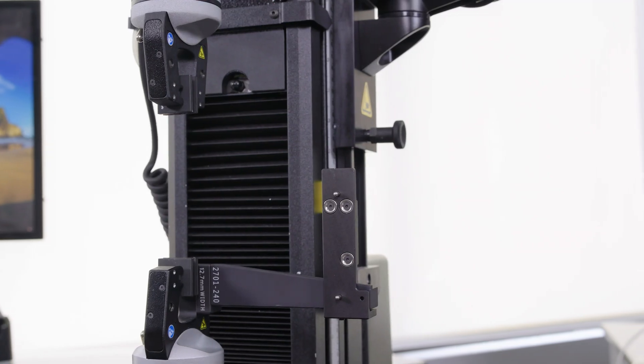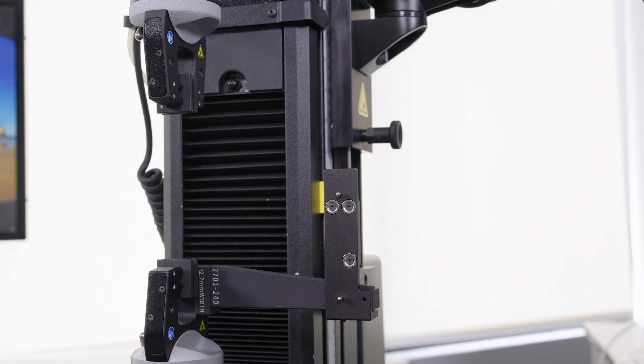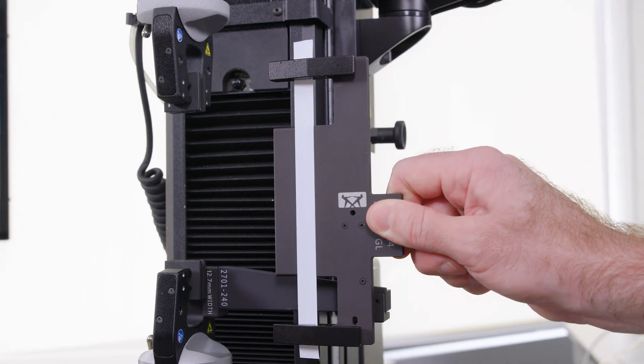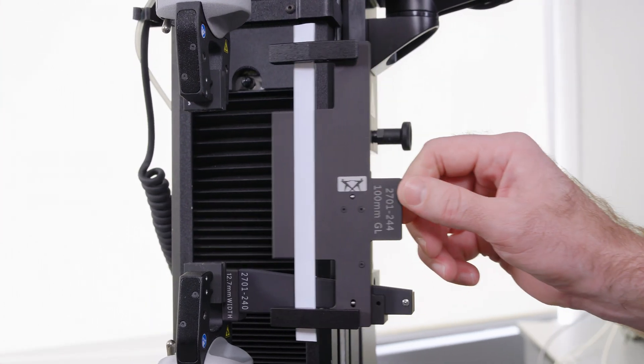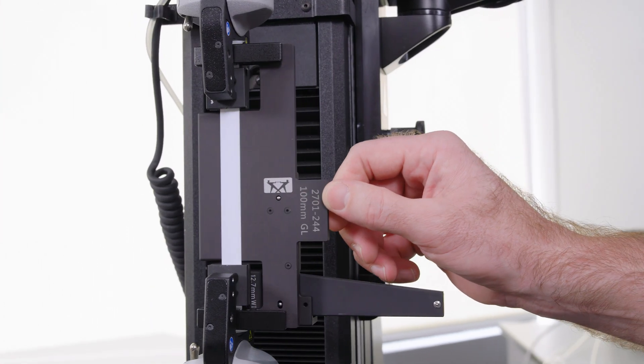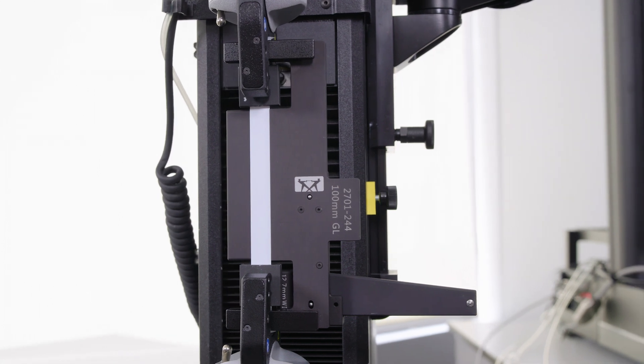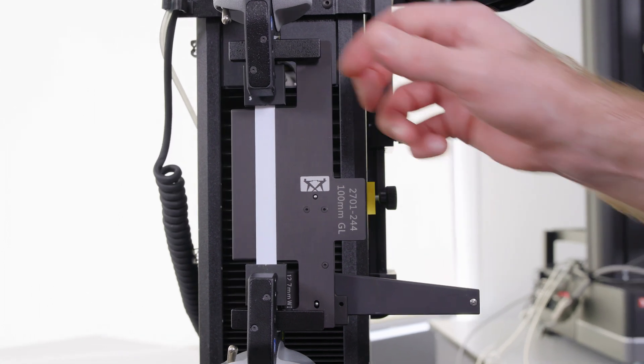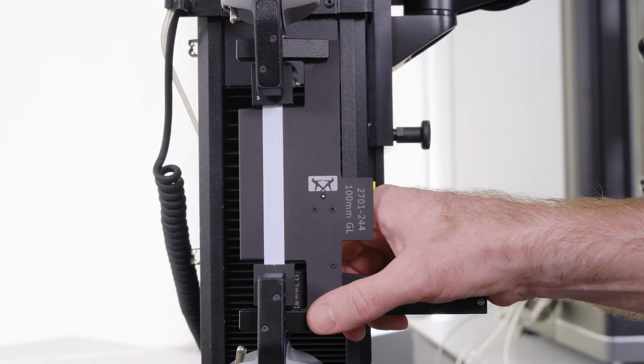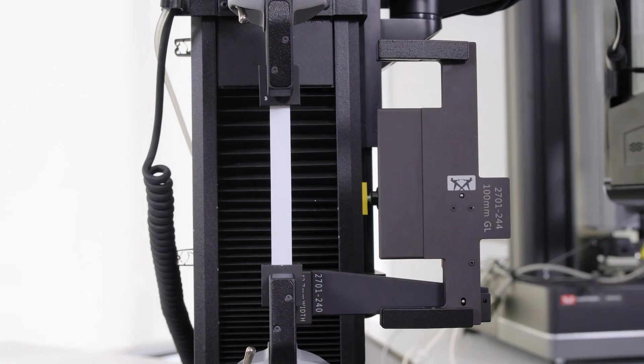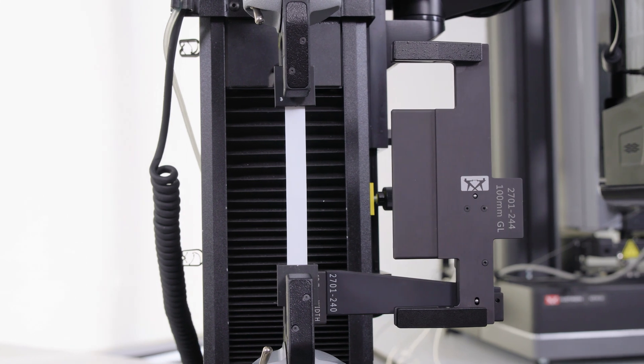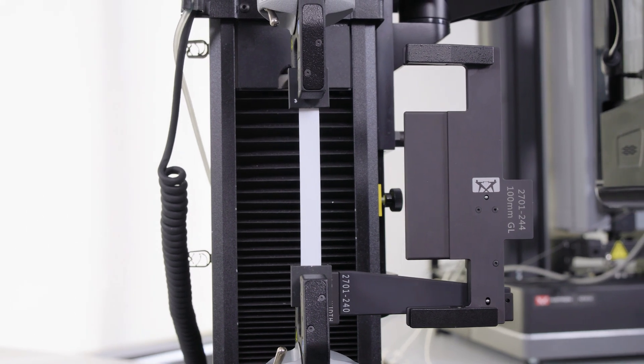Now you can snap the alignment clip onto the linear rail, move your specimen into the test space, and then close your jaw faces. At this point, you'll just need to make sure to release the alignment clip on both ends and slide the device out from the test space before beginning your test.